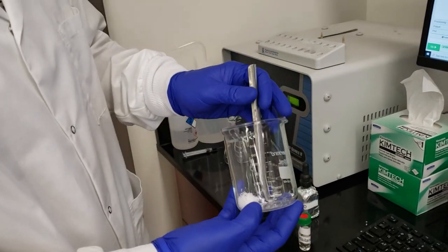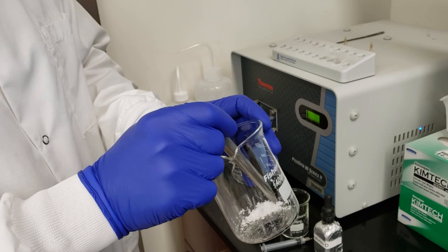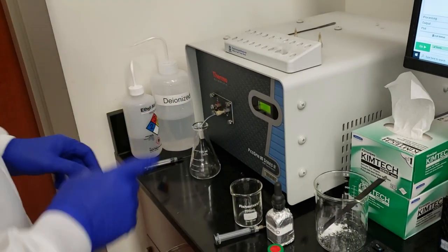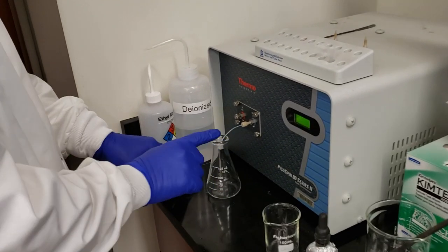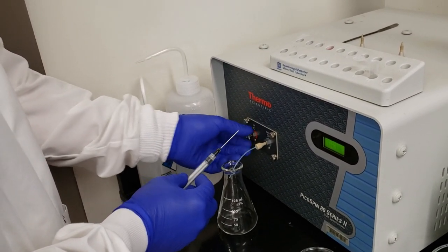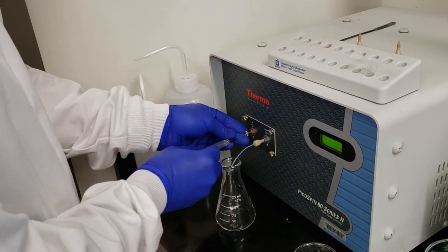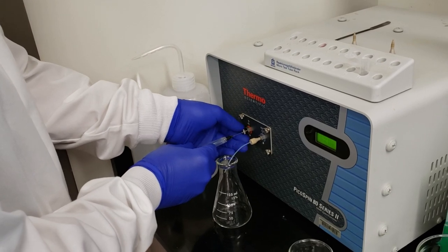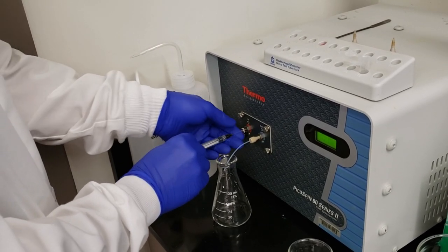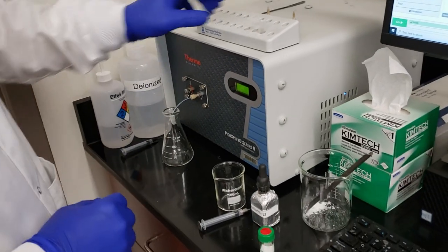So we just got done characterizing our product with the IR. Now we've come over to our picospin here. So I'm going to set this aside for just a second. First things first, we have to push our DI water out of our loop. That's always our first order of business. Screw the inlet down, push out our water. It's good to go.